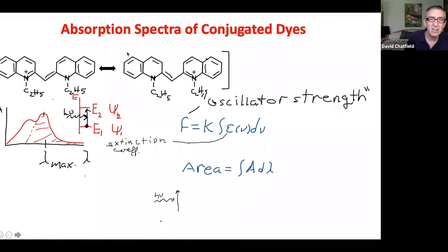Now you may be thinking, oh, how am I going to integrate this curve? Do I have to do a fit? Well, it turns out that we don't need to know the area very exactly. So we suggest that you do this really simple thing. Draw a triangle, just use straight lines. And then you can measure the area of the triangle, just use a little geometry. The formula is given in your text. And that's going to be the area.